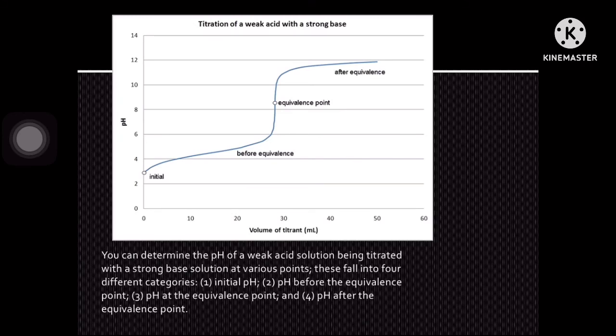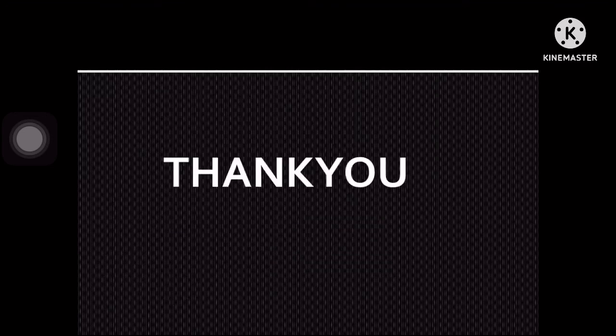This is a graphical representation: the initial phase, before the equivalence point, at the equivalence point, and after the equivalence point. The graph will grow like that during the volumetric analysis.